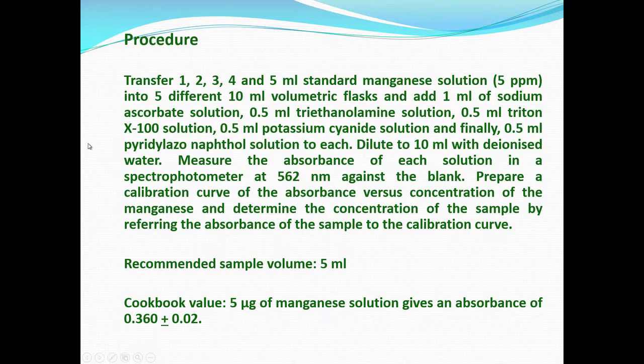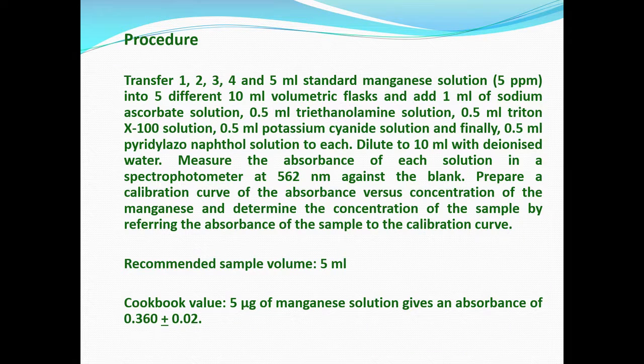I would like to tell you that the interference from about 1000 ppm, I would like to report to you: iodide, chloride, fluoride, sulphate etc., nitrate, most of the anions, phosphate, bromide, citrate, tartrate, Triton X 100, of course we are using it as a reagent, and then SLS, sodium lauryl sulphate, all these things at 1000 ppm do not interfere.